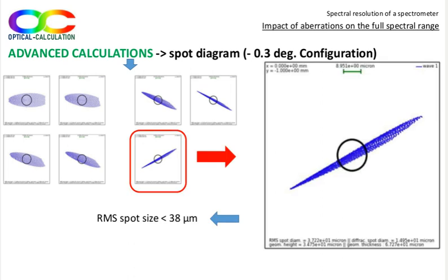In any case, the maximum RMS spot size is smaller than 38 microns at any height of the slit. The result is slightly identical with an angle change of plus 0.3 degrees. Thus, I will not present it.